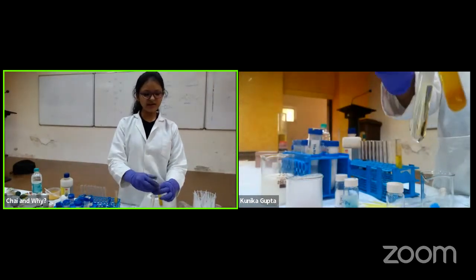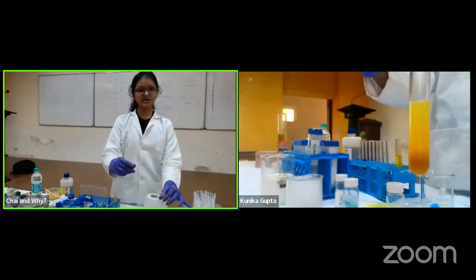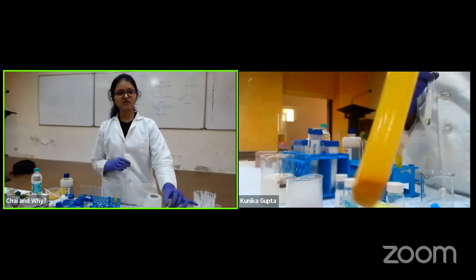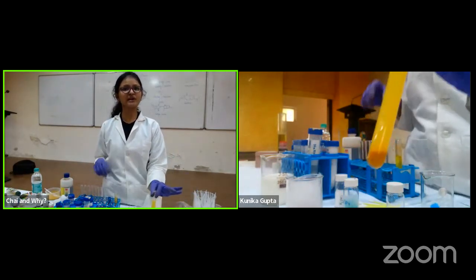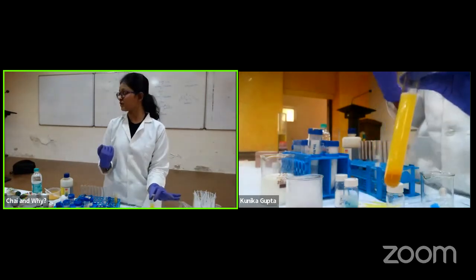Okay, so here I have haldi. Here I have dissolved Vim liquid in water. Let's see if this is enough to change the color. It is actually not. So why is it so? Because the Vim liquid that you have is actually a mild detergent. So I told you, right? It's a bank where somebody is donating a proton, somebody is donating a hydroxide.